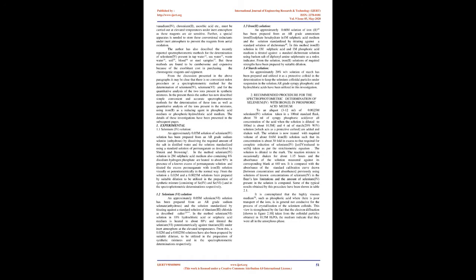In the present thesis, the author has now described simple, convenient and accurate spectrophotometric methods for the determination of these ions as well as quantitative analysis of the ions present in the mixtures, using iron(II) as a reducing agent in phosphoric acid medium or phosphoric-hydrochloric acid medium. The details of these investigations have been presented in the subsequent pages.